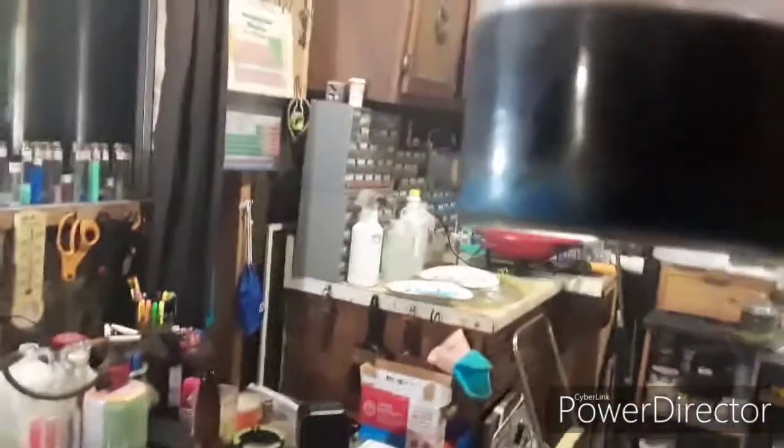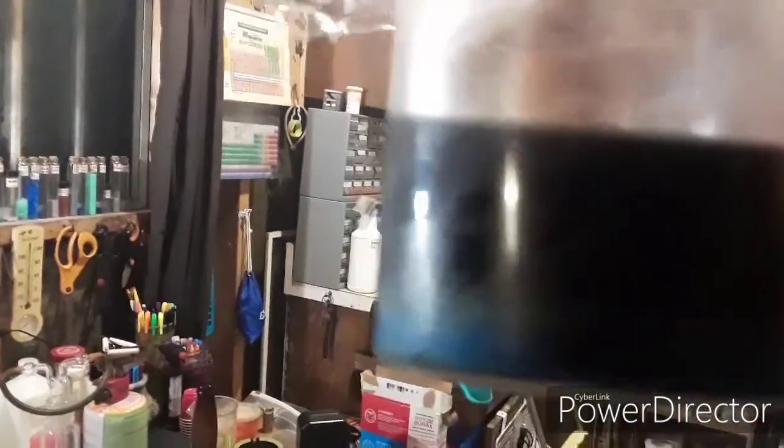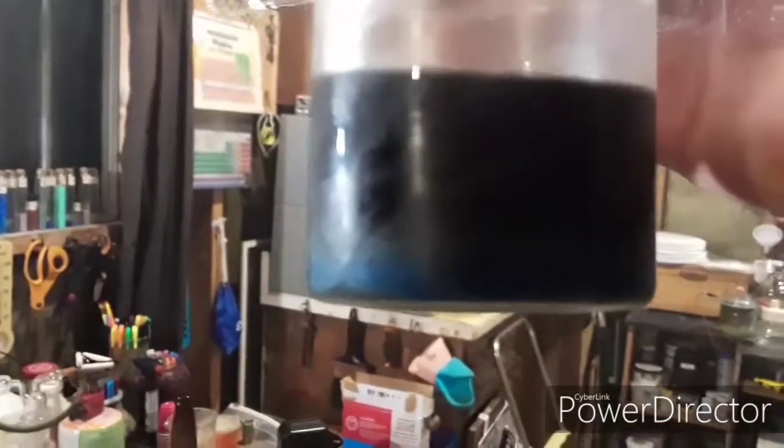Alright, so it's been about 2 hours and 20 minutes. Gonna get our CHP out of the fridge. Bring this guy over here. And we got a lot. You can see there's a lot of crystallization in the bottom there. All that blue area that you see, that light blue. Kind of hard to see, but that is all the crystals. You'll see them here momentarily as we filter this.